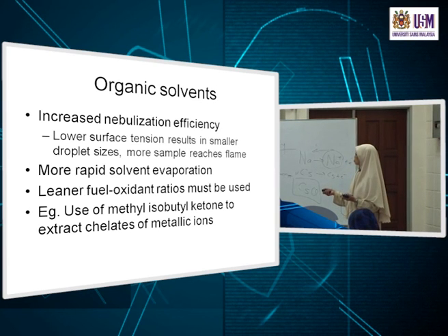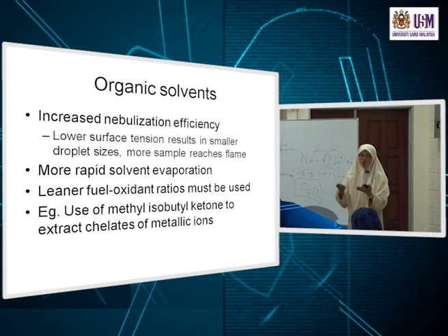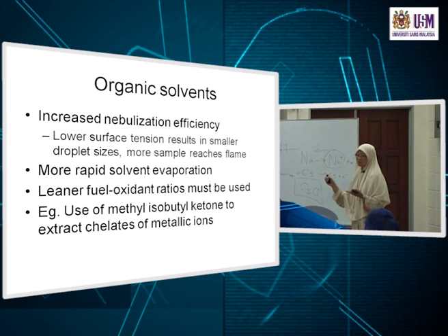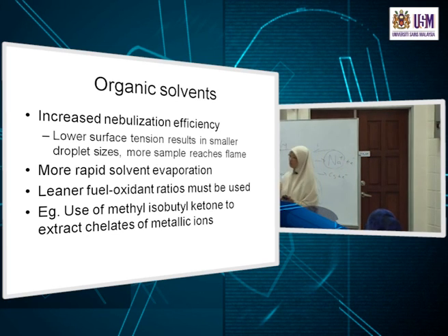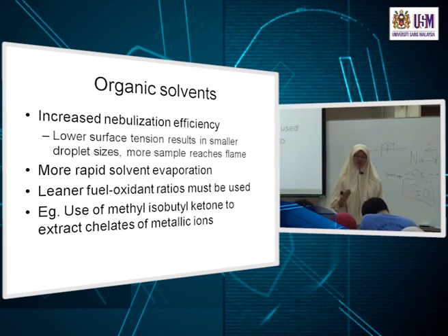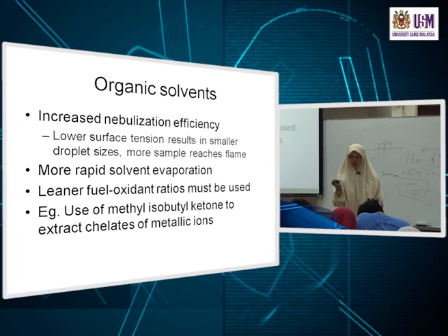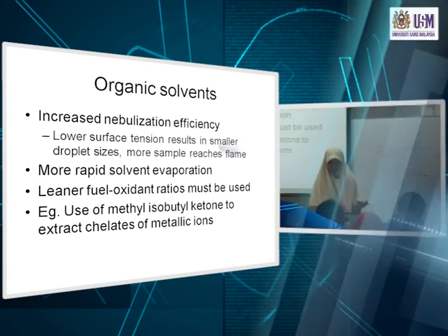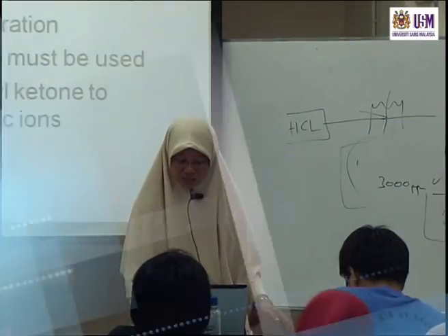However, when you use this MIBK, you have to use less acetylene, because the MIBK acts as a fuel also, and you're introducing the fuel. So when you do analysis in such a solvent, you have to reduce the fuel, the acetylene. Okay, so this is the effect of organic solvents, which sometimes you try in the lab and it should go higher and yet it didn't, but still you put it down as, yes, it increased for whatever reason. Okay, so that's the last thing for today.